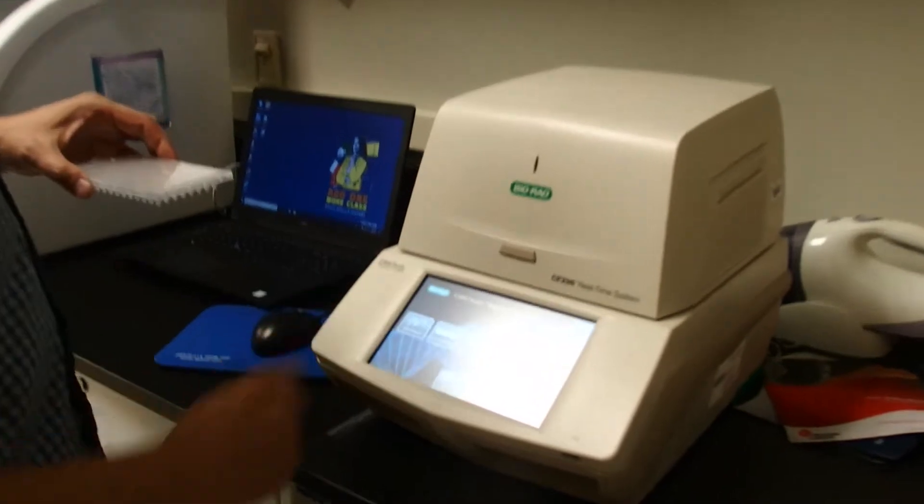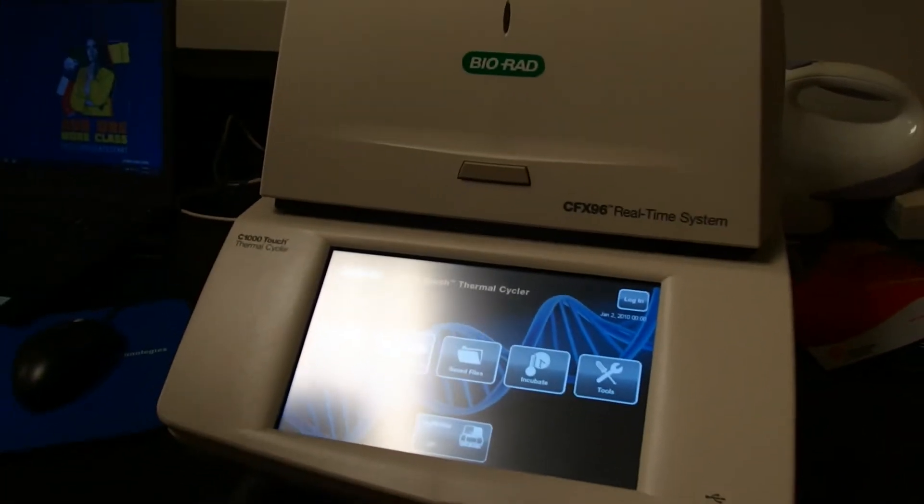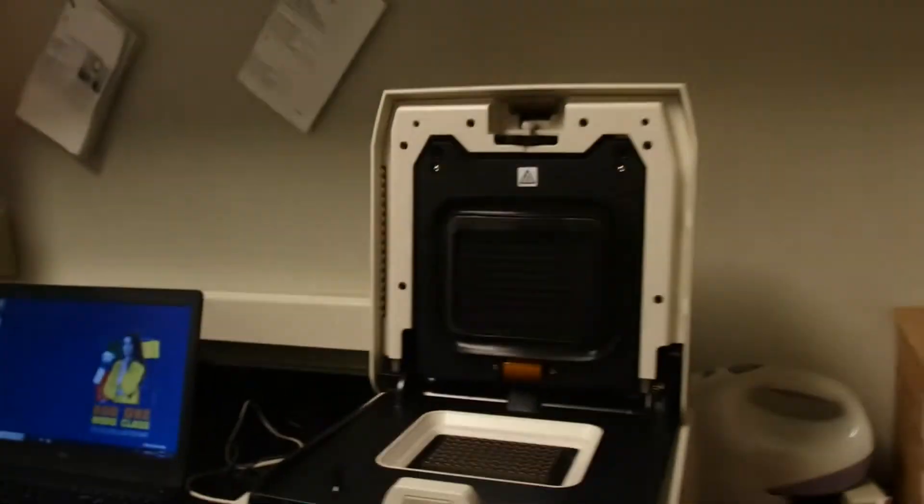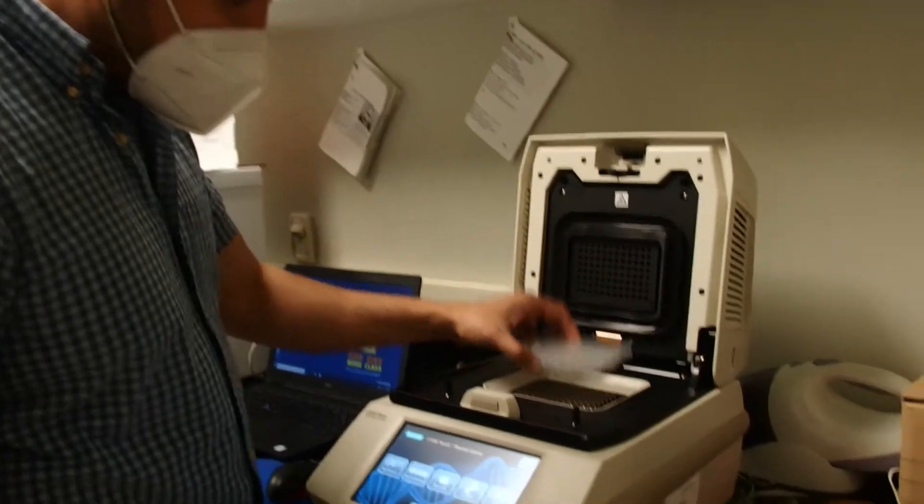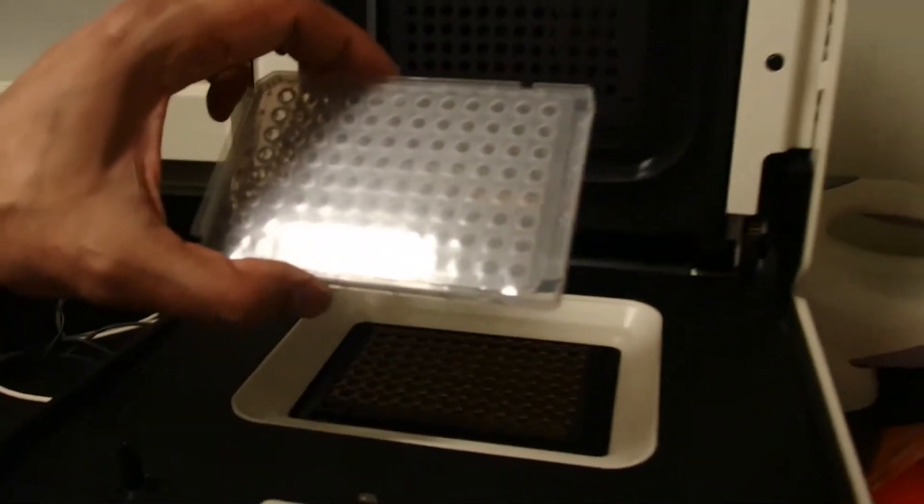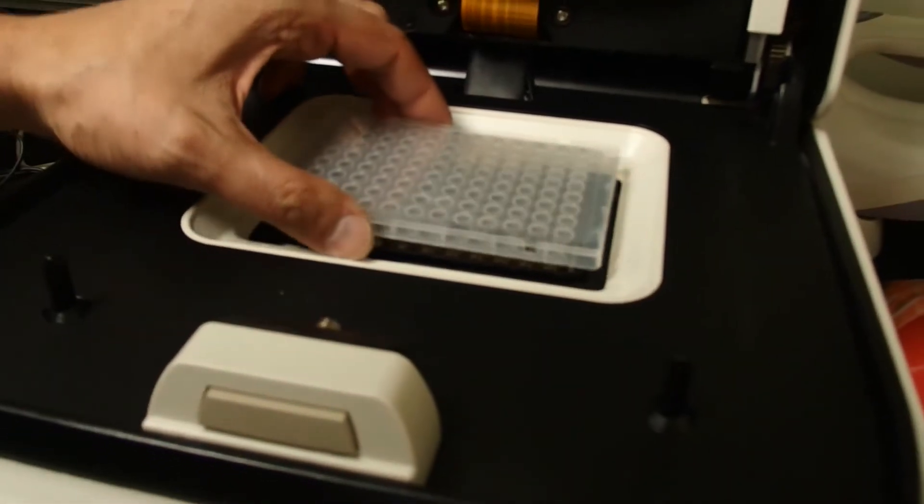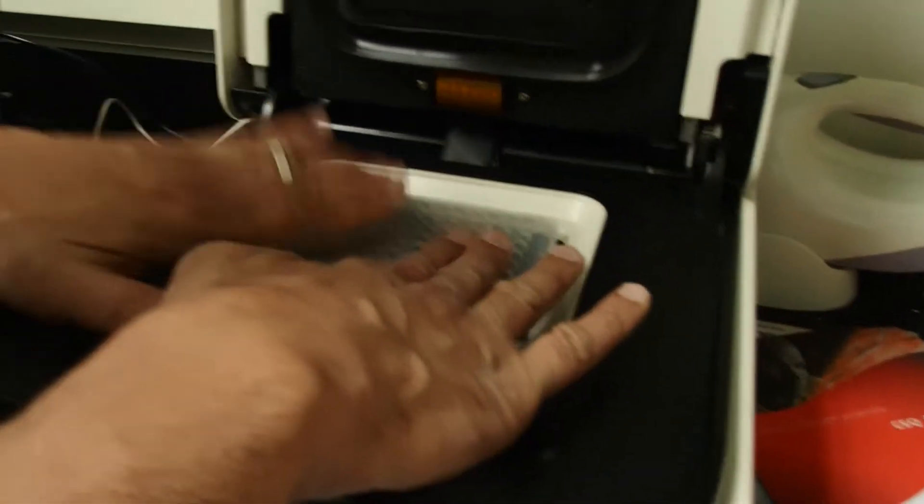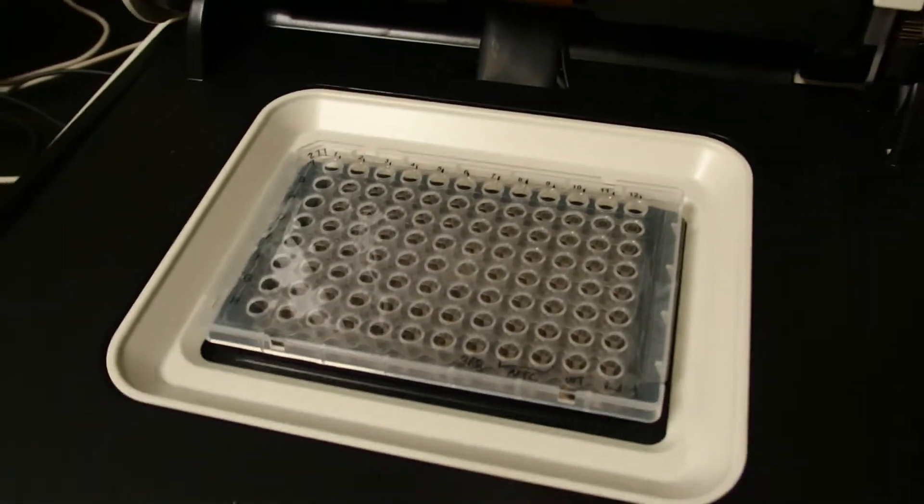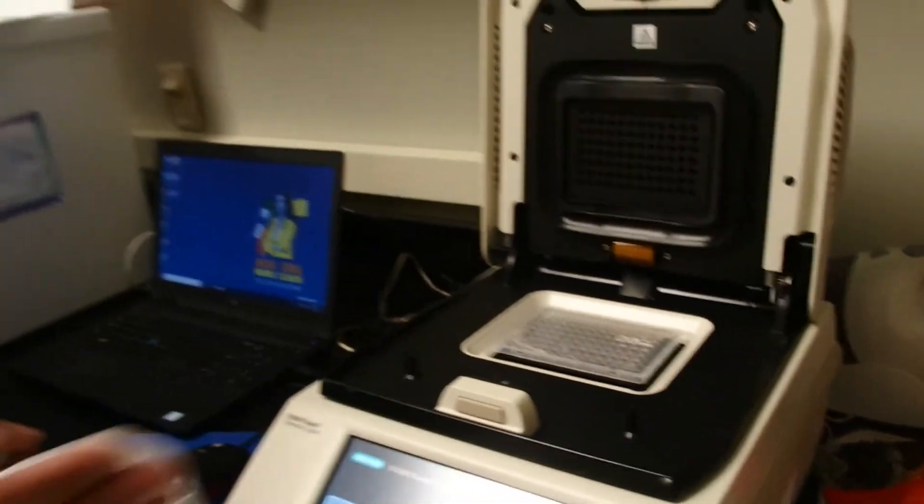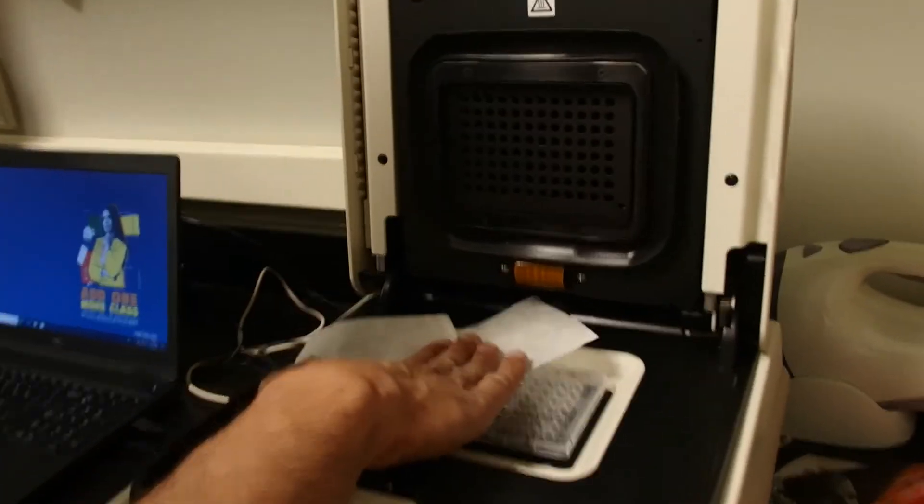Now I'm just going to spin this down again and then we'll do the qPCR. In our CFX you just push that button there, it's all automatic. I still have my secondary film on there. You got to put the plate in the right orientation. That means whatever orientation you put it in will be the way the data will be. I'll spread this out, make sure it's sticky, take this away. It should look really clear in there. I'm going to take a kim wipe and lightly polish it and then we'll press the button.